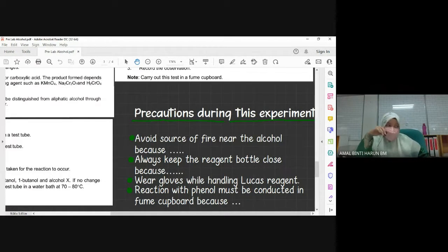Sebab lepas buat tu, you kena cuci test tube tau. Sepatutnya tak payah cuci test tube pun. Sebab alkohol kan, biar pembantu makmal je cuci test tube tu. Sebab bila student cuci test tube, dia buang semua alkohol yang dia gunakan tu dalam sink dan cuci macam biasa, cuci cawan tu. Tapi apa yang terjadi adalah alkohol itu masuk ke dalam sink dan dia akan evaporate dan seluruh makmal tu akan contaminated. So bila evaporate, you akan terhidu gas alkohol tu dan akhirnya pening kepala.